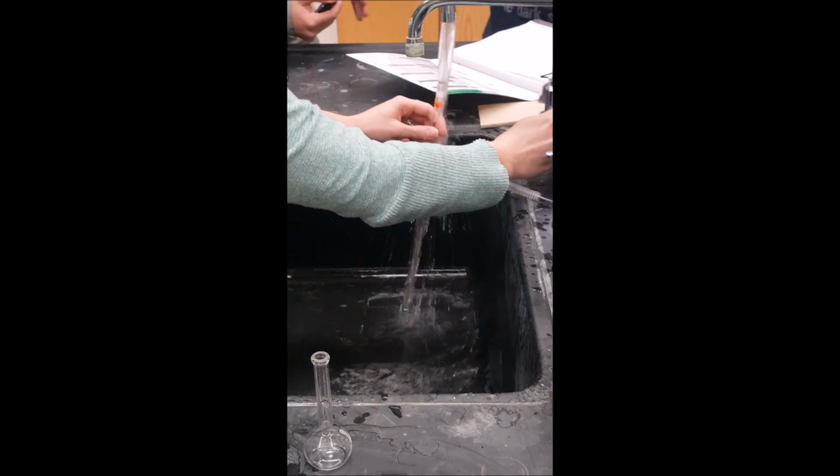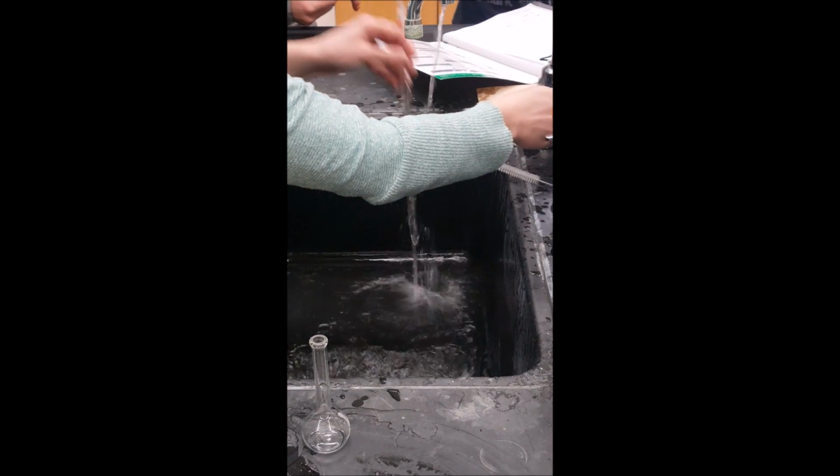After you've done that, make sure that you empty out your contents into the sink and rinse your glassware thoroughly. The difference between a stock solution and a dilution is that a stock solution has a higher concentration and your dilution has a lesser concentration than your stock solution.